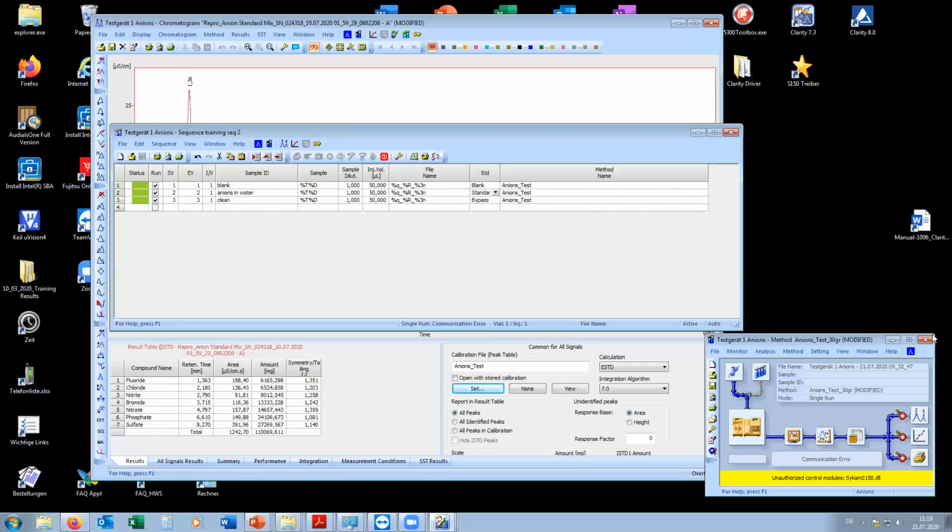It's a little box with 6 serial RS232 connectors. The instrument connects to this box, which is basically a virtual COM box. It makes virtual COM ports from each serial cable coming from the instrument. To the computer, you only connect this box. It's plug and play. You don't have to install anything.